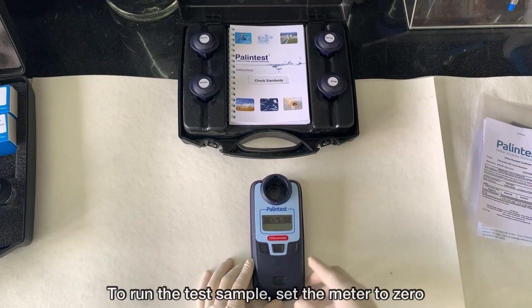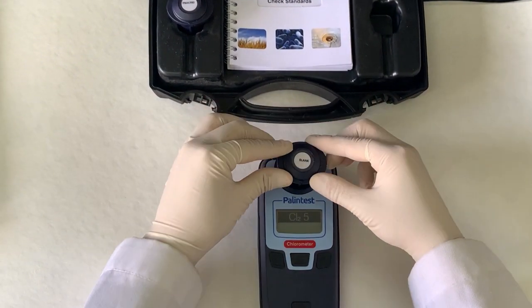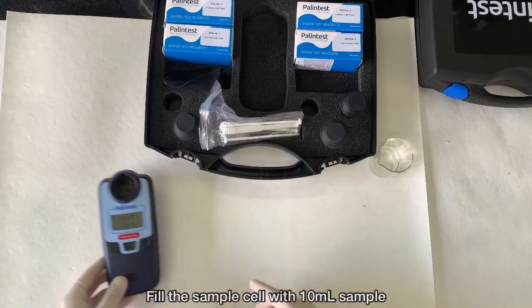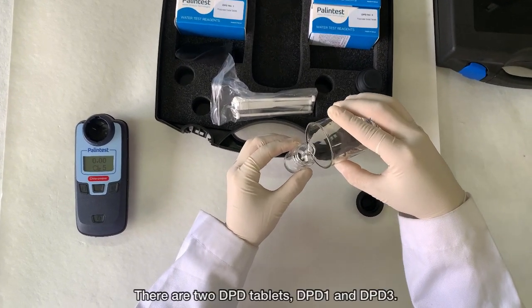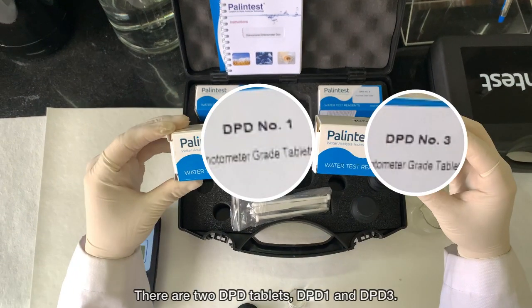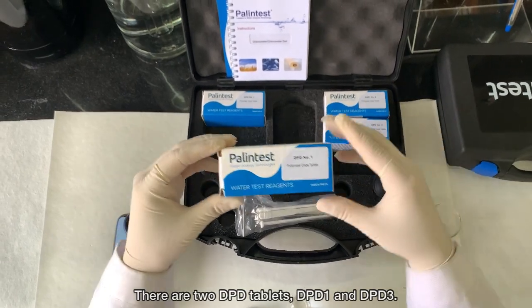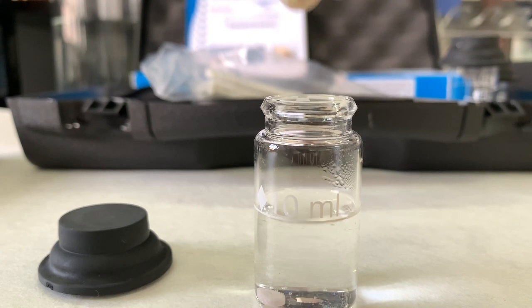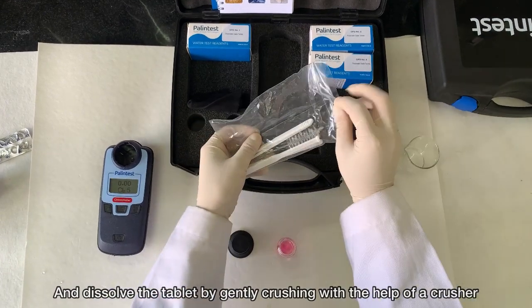To run the test sample, set the meter to zero. Fill the sample cell with 10 ml of sample. There are two DPD tablets: DPD-1 for free residual chlorine and DPD-3 for total chlorine. Add one DPD-1 tablet into the sample and dissolve the tablet by gently crushing with the help of a crusher.